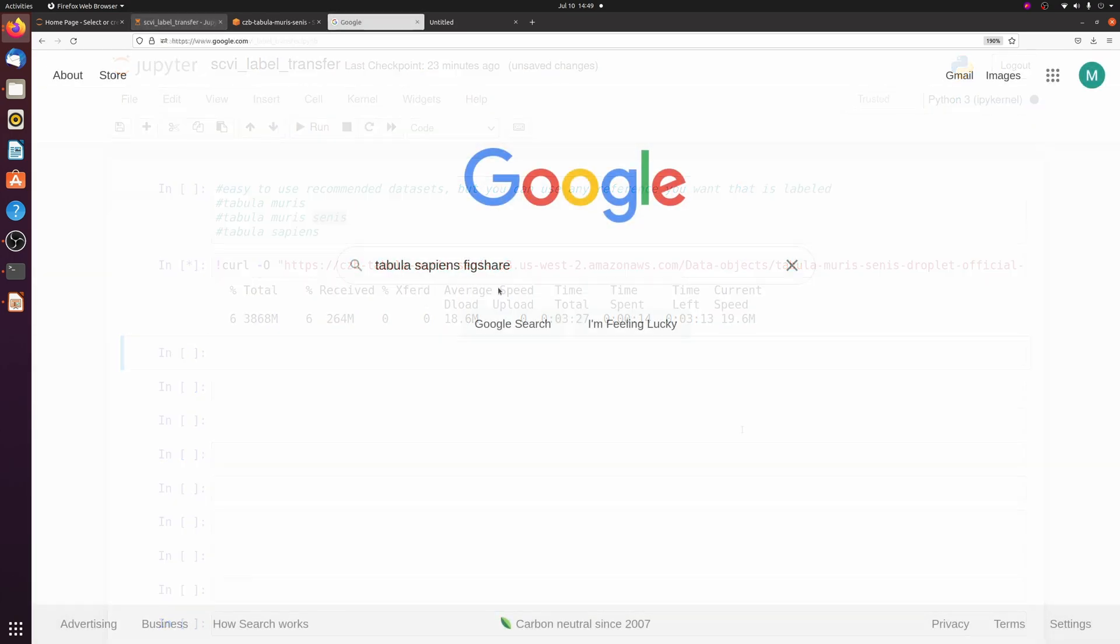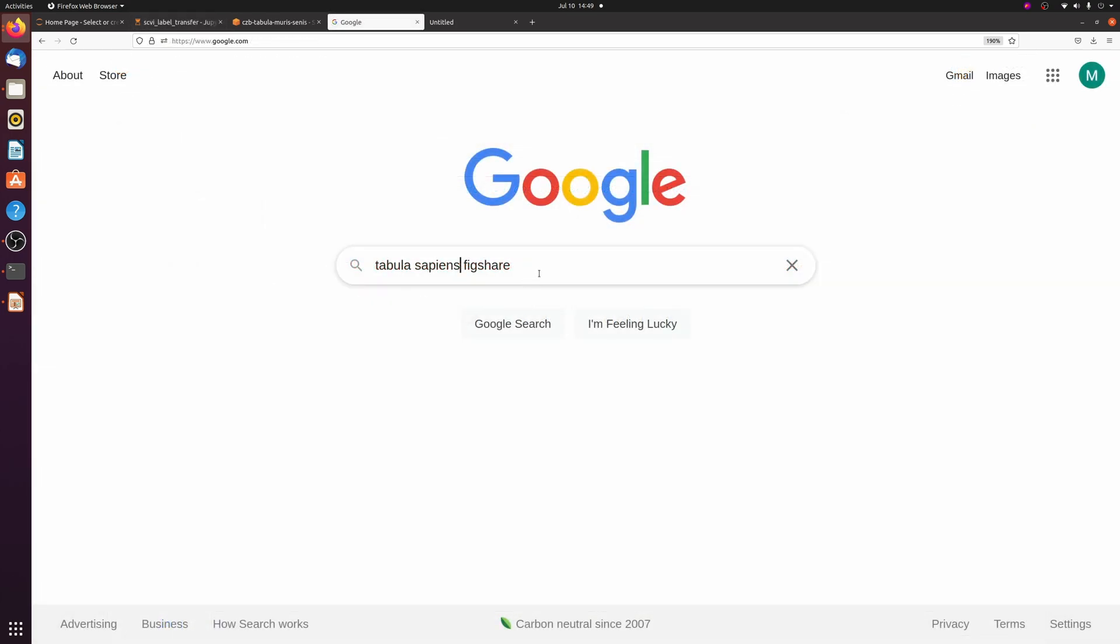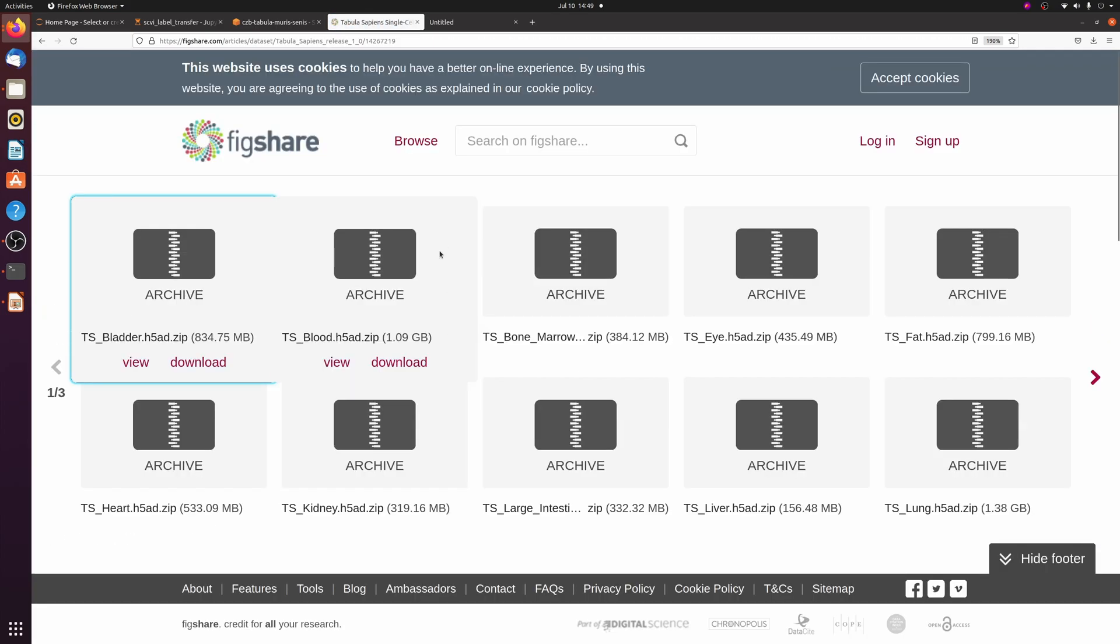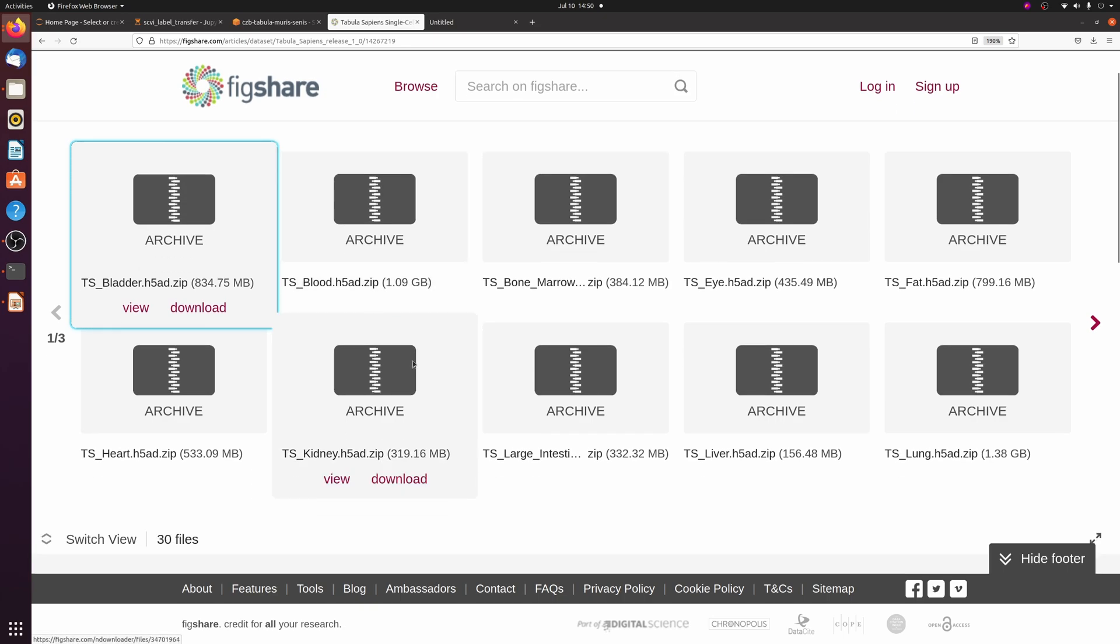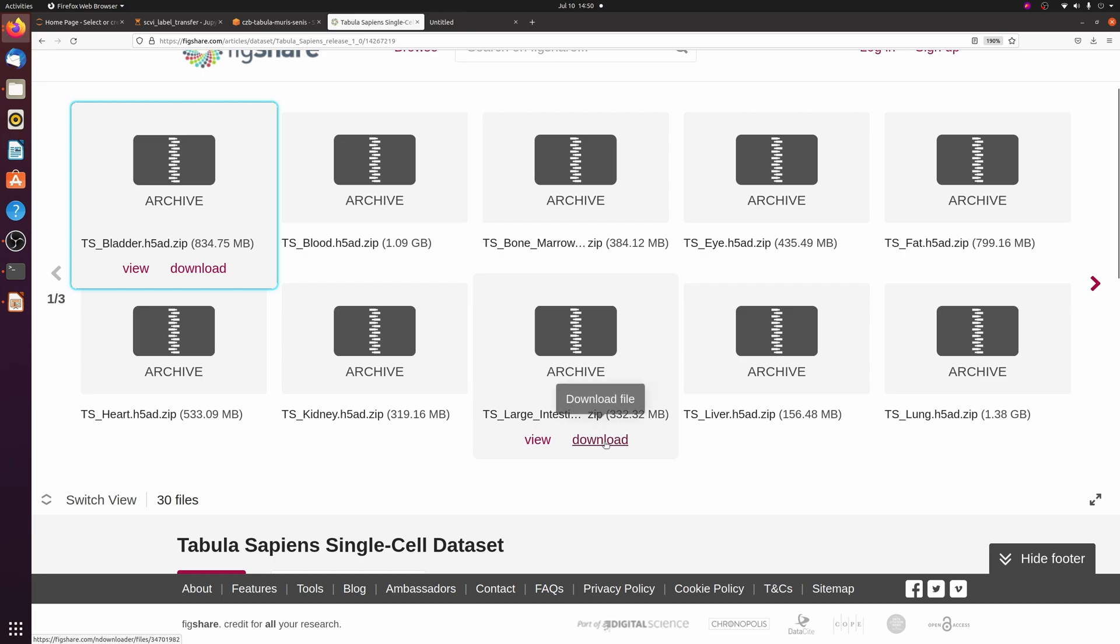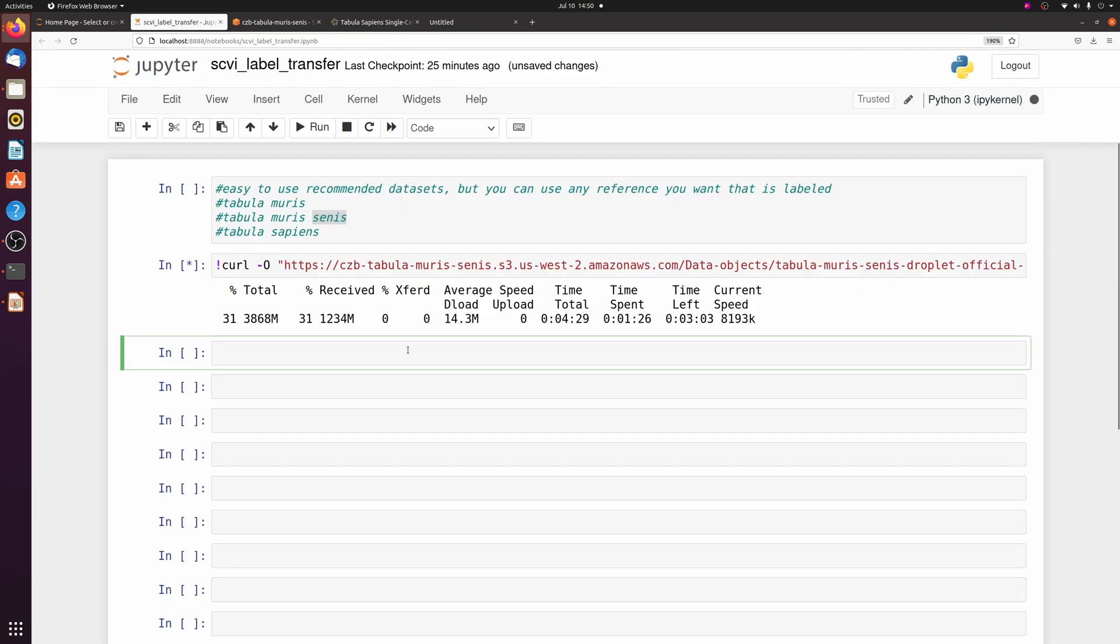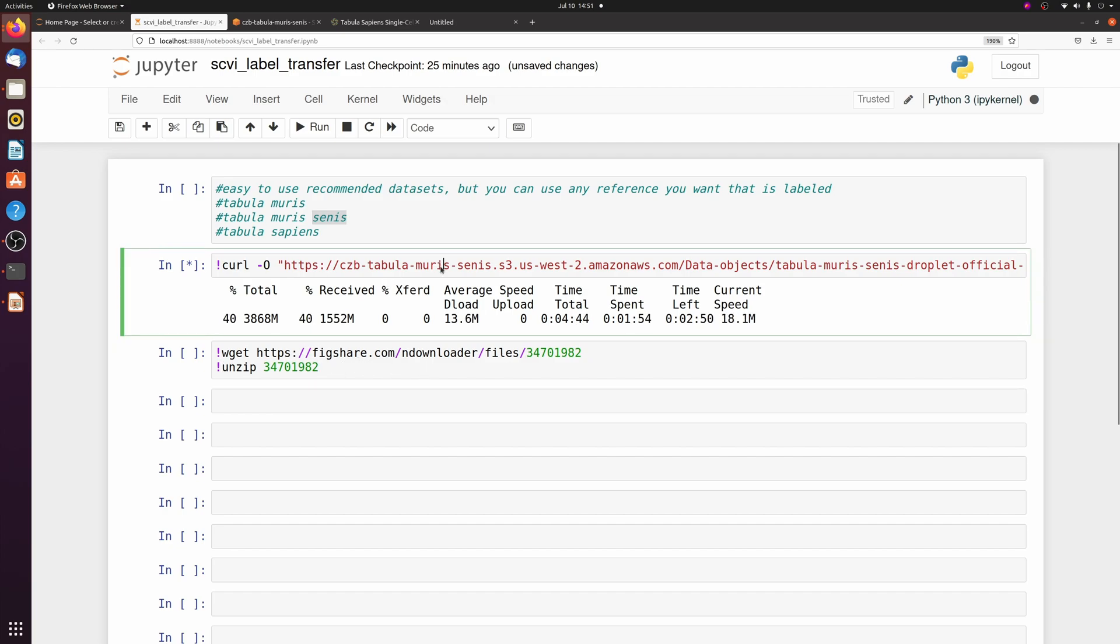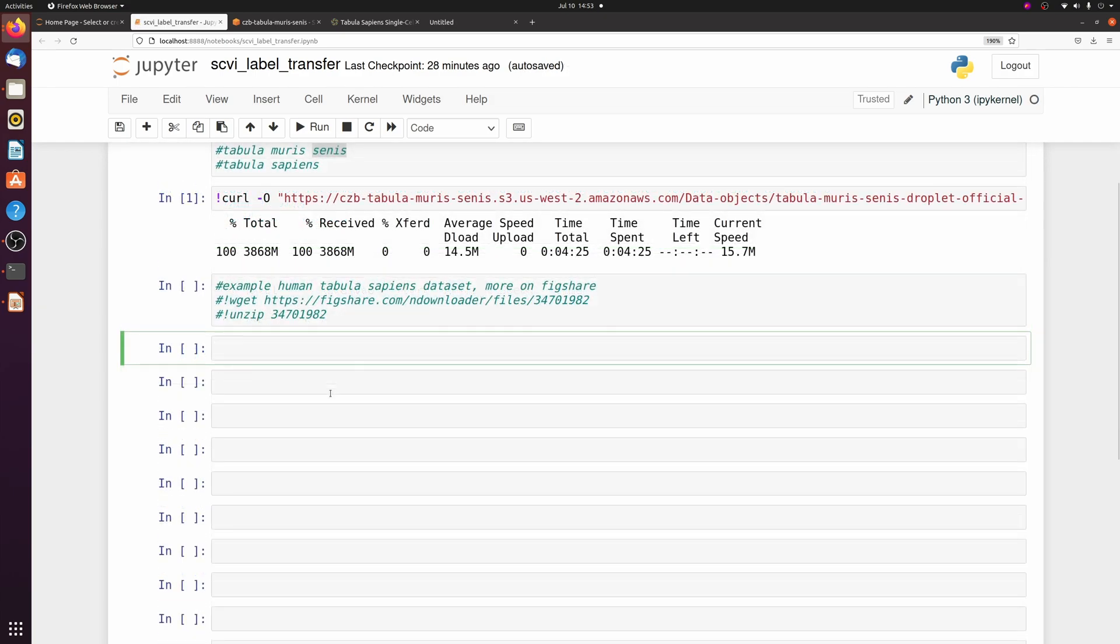And instead if you had human data, you can just Google Tabula Sapiens Figshare and go to that first link, and then you can find which dataset you're interested in. You can download it directly to your computer just by clicking download, or you can right-click, copy link, and then for this, I think Figshare, you need to use wget and then you'll need to unzip it. Then you should have that h5ad file accessible. Anyway, we're just going to use this Tabula Muris Senis one when it's finished downloading.